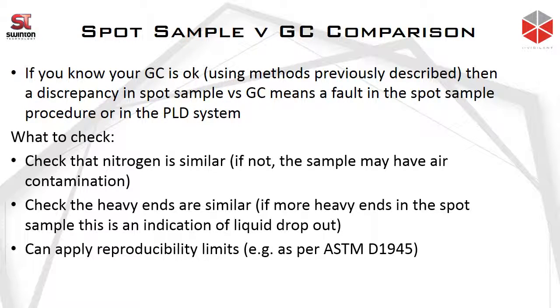To identify whether the two samples, the spot sample and the GC analysis, are similar, we can apply the reproducibility limits as given in the ASTM D1945 standard.